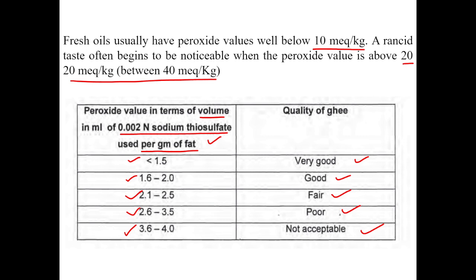So this way we are determining the peroxide value of ghee. In this video we have learned about the procedure, the reactions involved, the calculations, and also the interpretation of the results obtained from determining the peroxide value of any sample.